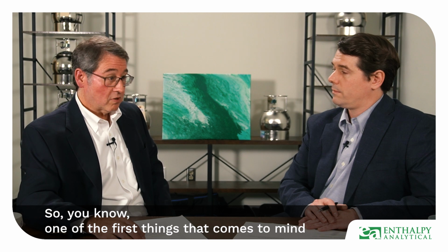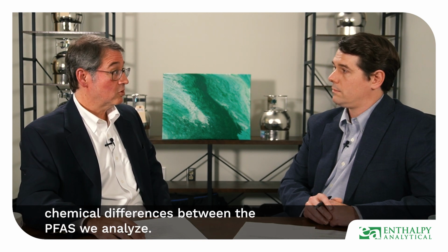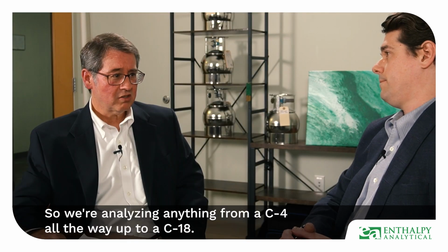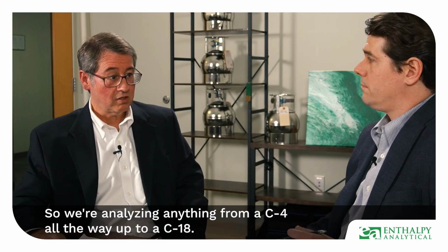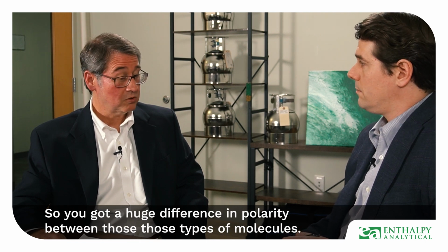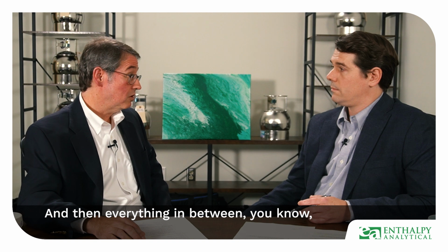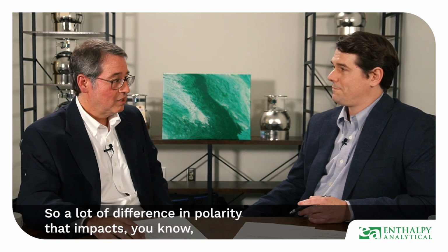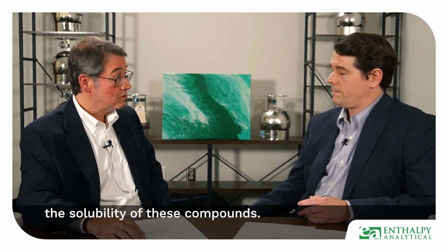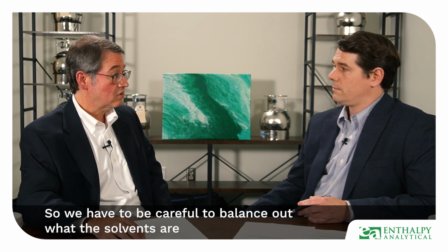So, one of the first things that comes to mind when it comes to PFAS analysis difficulties is the physical chemical differences between the PFAS we analyze. So we're analyzing anything from a C4 all the way up to a C18. So you've got a huge difference in polarity between those types of molecules. And then everything in between, so it's not just C4 to C18, it's C4, C5, C6, and so forth. So a lot of difference in polarity that impacts the solubility of these compounds. So we have to be careful to balance out what the solvents are that we're dealing with.